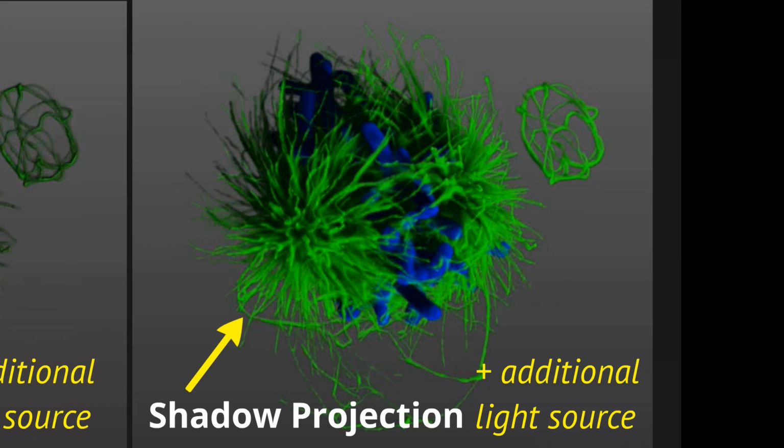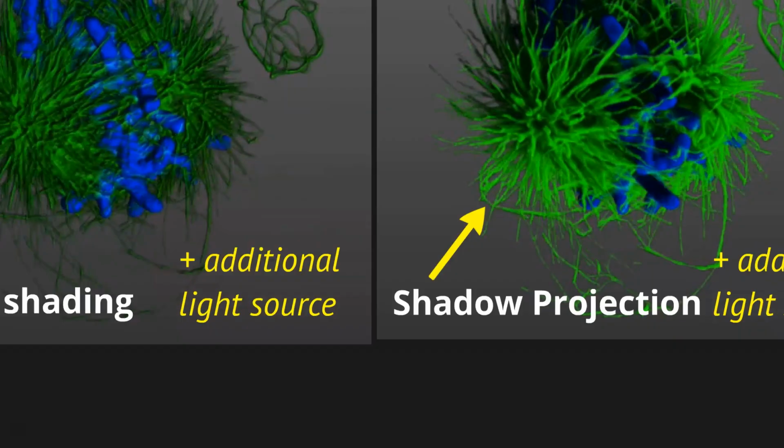Okay. Now this one will take a little time to render if your data is big. If it is 2 gigs or under, you probably won't notice a difference, but as the data set gets bigger, you'll notice it will start to take time. So if this is what you really want, then be patient. It's worth it. We're going to go over these rendering techniques in the application tutorials this afternoon so you can see how to optimize.